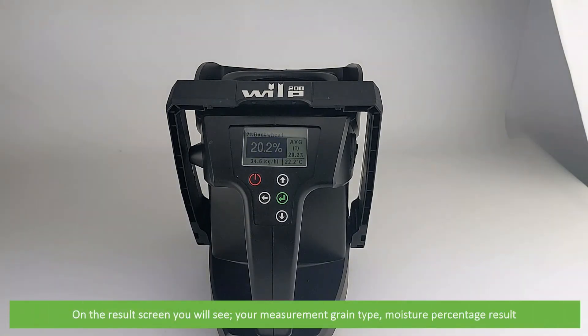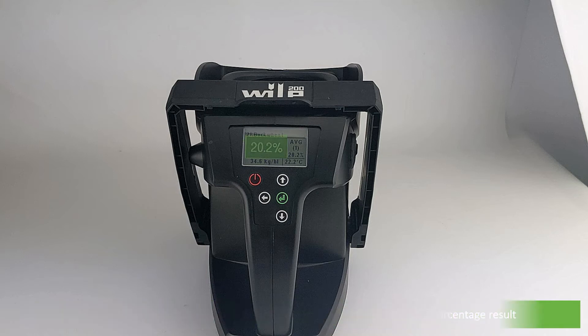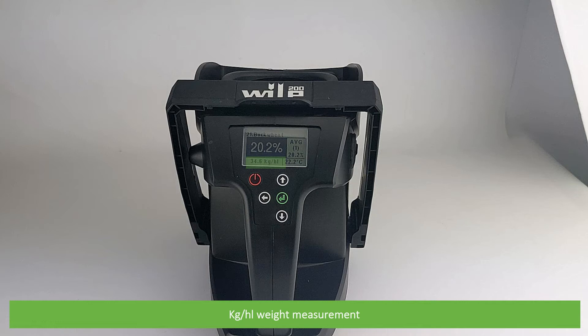On the results screen you will see your measurement grain type, moisture percentage result, kilograms per hectolitre weight measurement, the average moisture percentage as well as the number of tests taken to calculate the average, and the sample temperature.